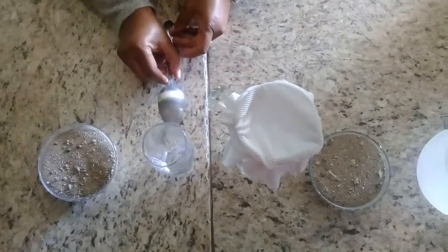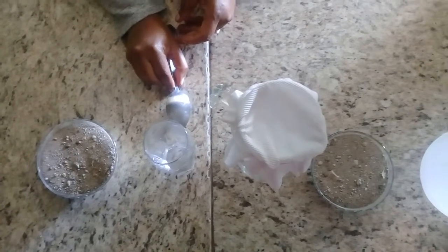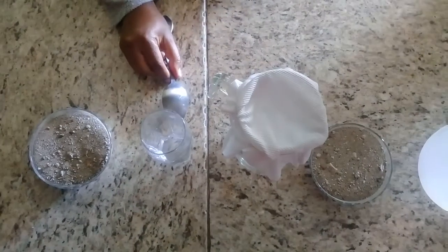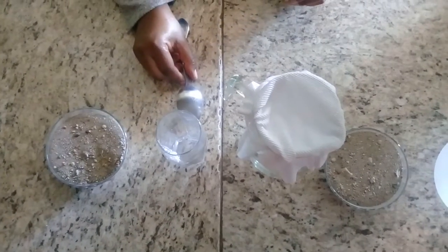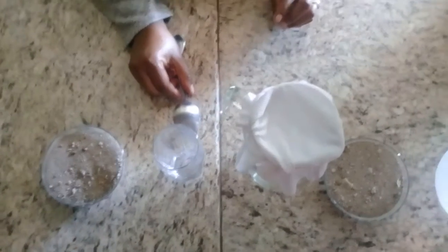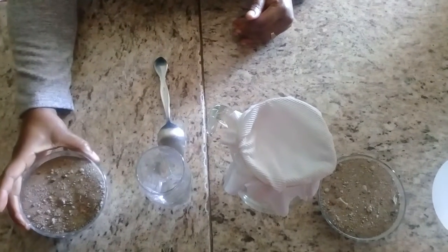Now, two methods in which we can separate mixtures from an insoluble solid are filtration and decanting. The first one I'm going to demonstrate for you is decanting. What is that all about? Decanting involves using a liquid, as mentioned before, and an insoluble solid, which is the sand.